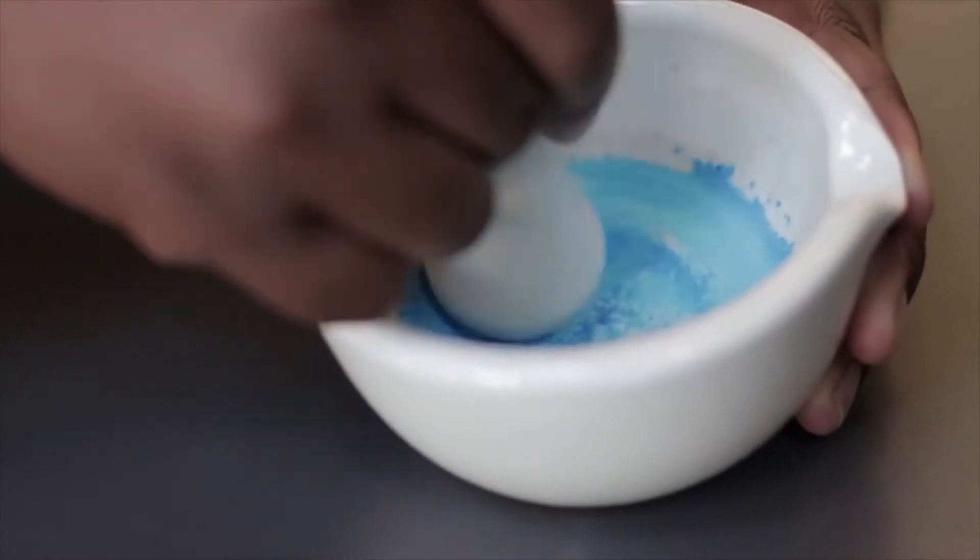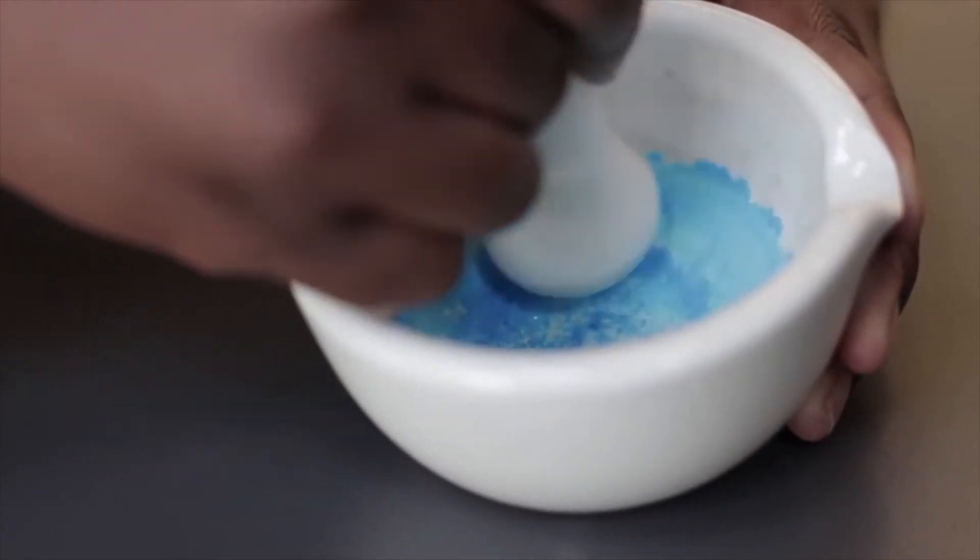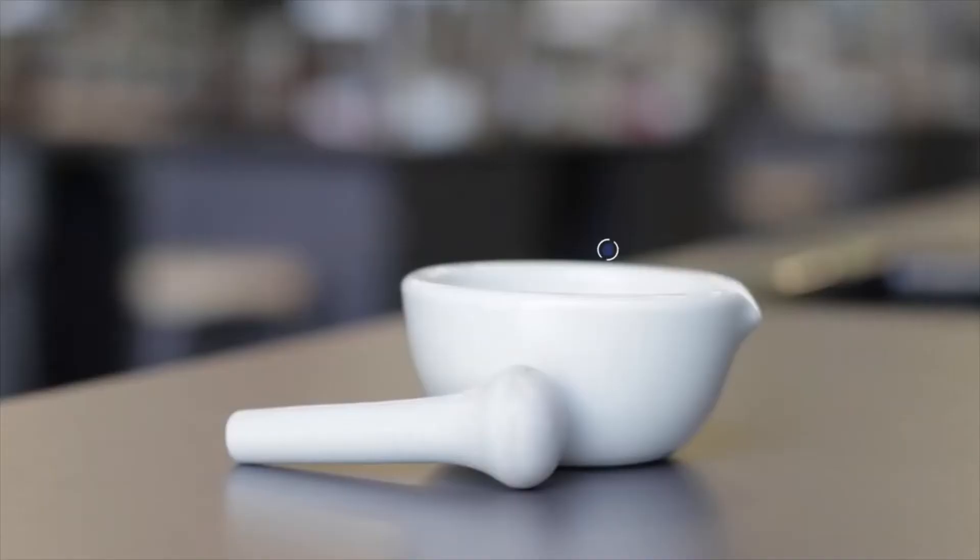A pestle and mortar is used for grinding and crushing samples into a powder. The mortar is the bowl. The pestle is the object that is used for grinding and crushing samples.